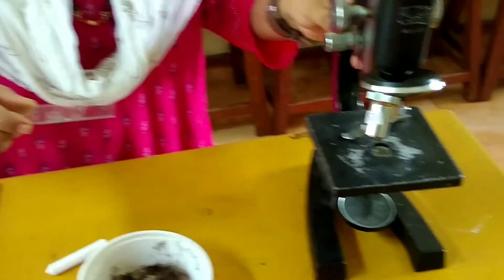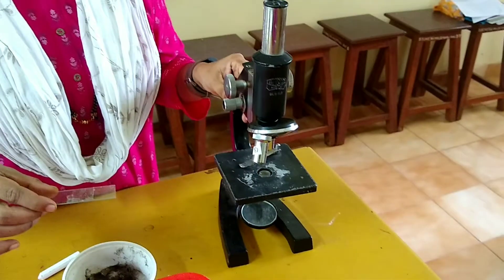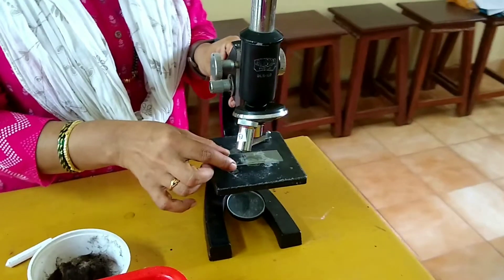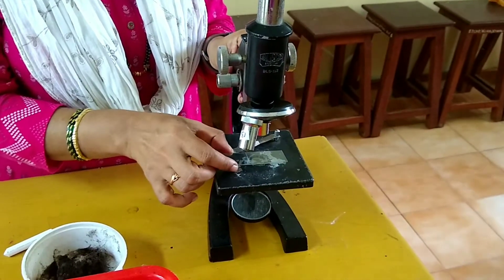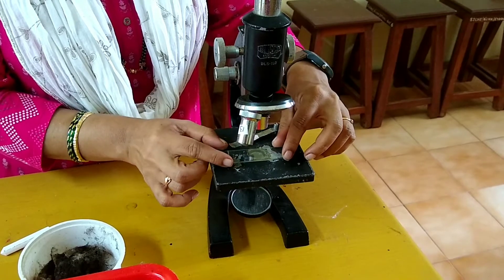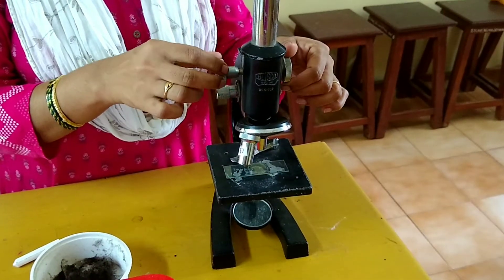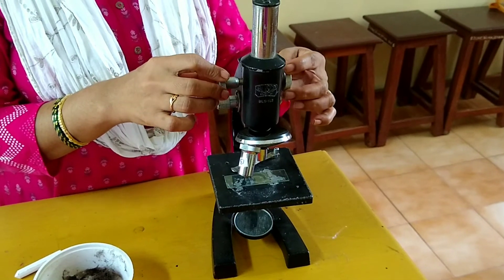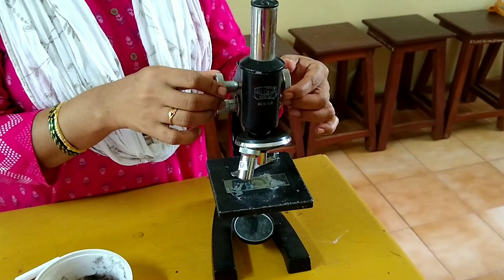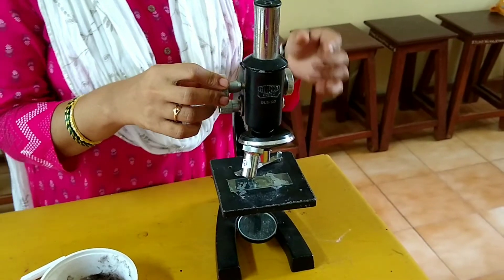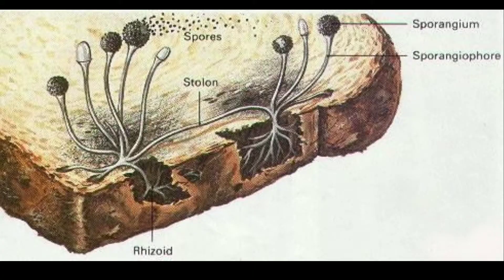We are using a compound microscope to observe the slide. After adjusting the compound microscope, you will get a clear picture of bread mold or Mucor. Let us see what we observe.